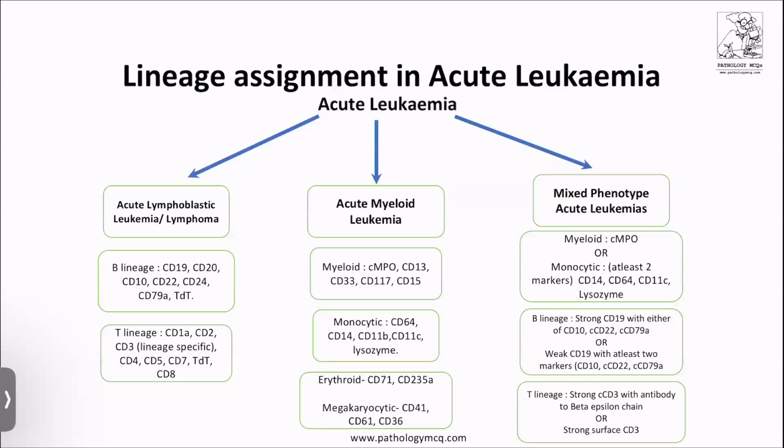No, we do not, because CD19 was weak. AMLs with CD19 dim expression can be thought of as core binding factor leukemias, where we see aberrant expression of CD19, CD79 and CD56 and so on.